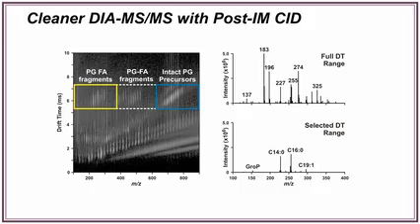And so when you look at your data, you get something that looks like this. This is a lipid example, so forgive me. This would be the drift time of all of the intact lipids, whether you're looking at MS1 or MS2. But in the MS2 data, all of the fragments then occur within the same band of drift times as their precursors.